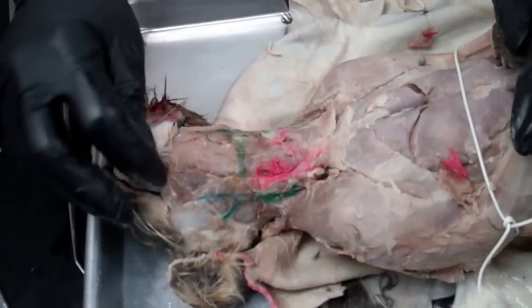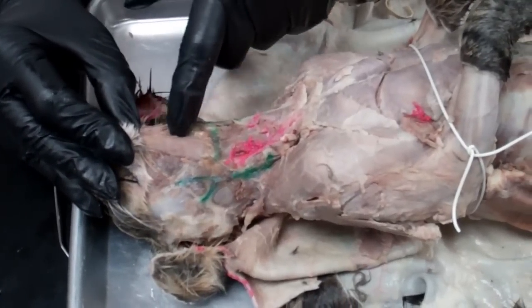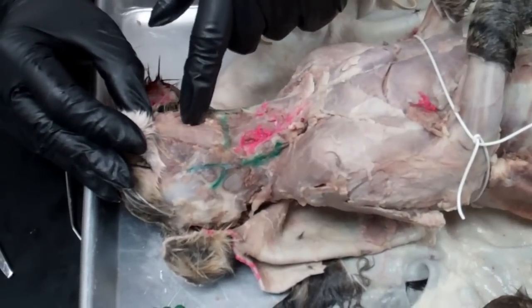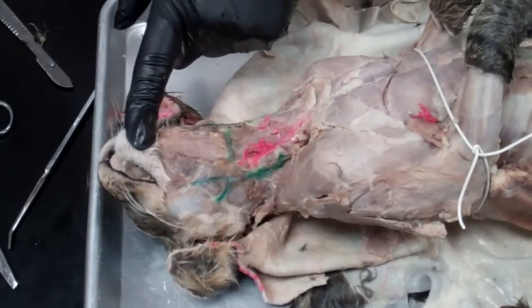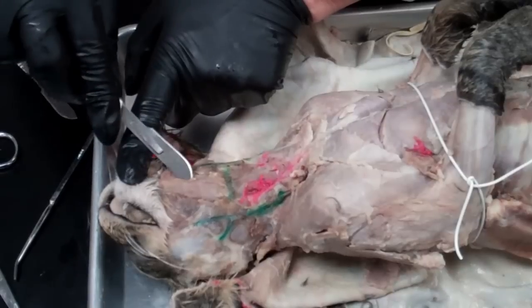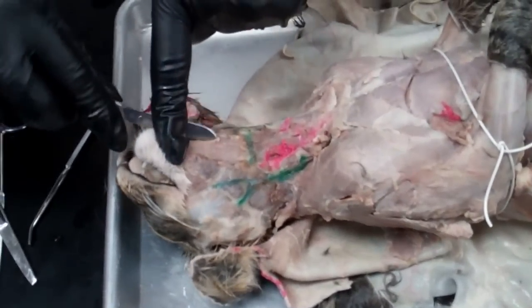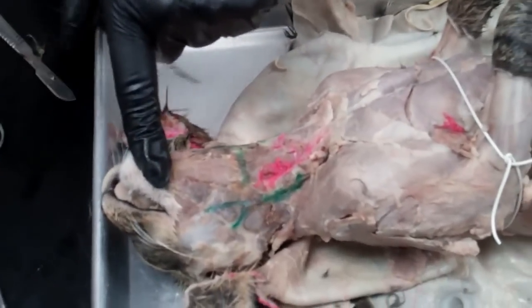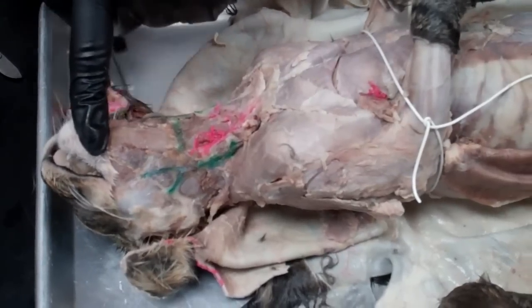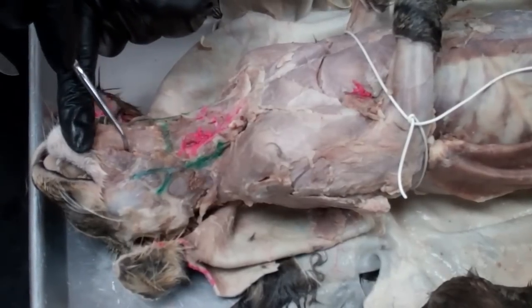The next thing we're going to be looking at are the structures found under the chin and in the neck of the cat. There's some connective tissue that you're going to have to get out of the way. You're going to find a muscle that goes up the middle of the cat — it's called the myelohyoid muscle. It runs right up the middle and if you look closely, it has horizontal lines going across it.